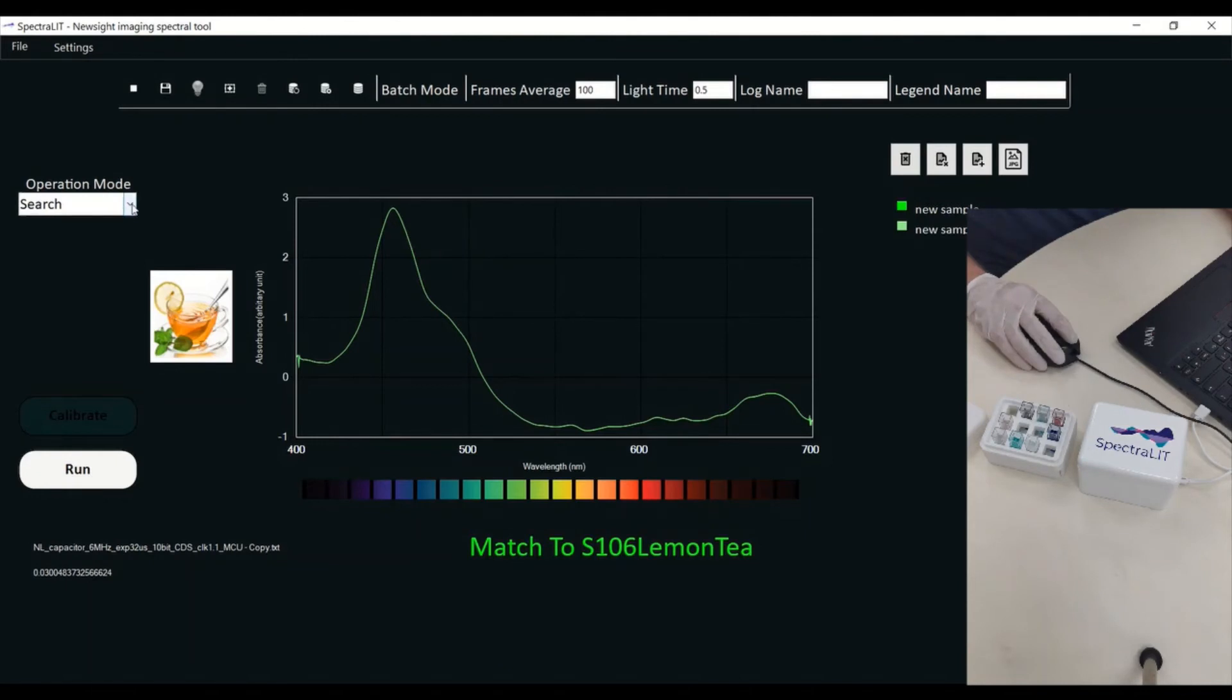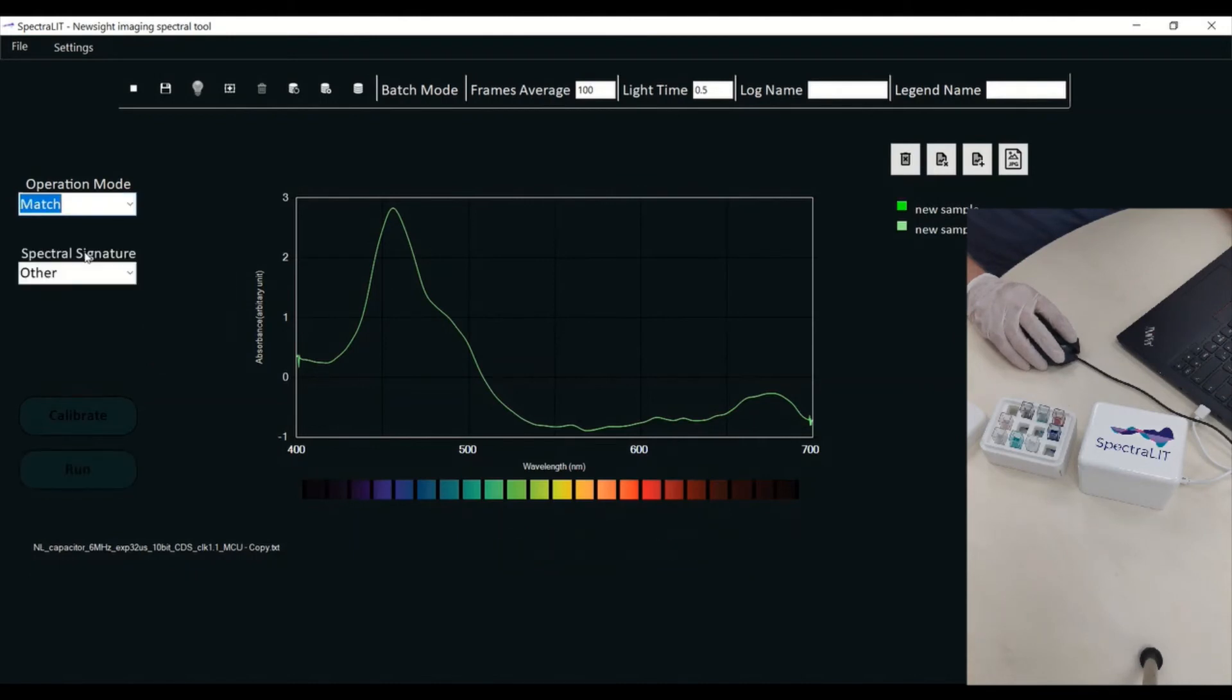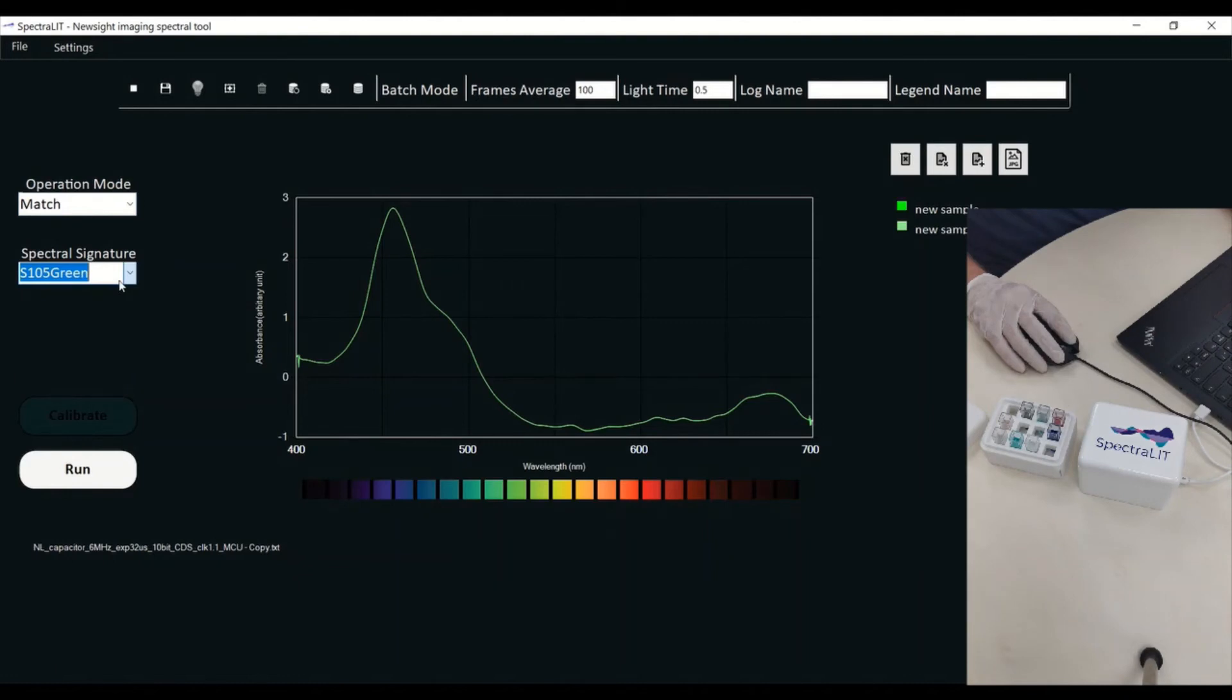I can also do a match. Match means that I'm taking a specific substance that I have in the system, and I want to see whether what I have inside the Spectralit is actually matching one of the items I have inside.